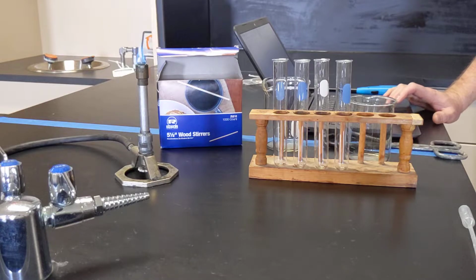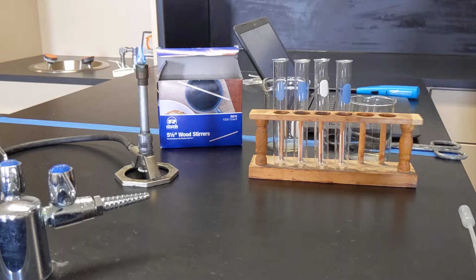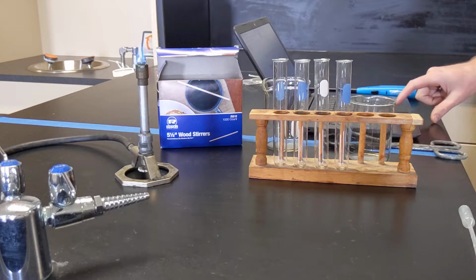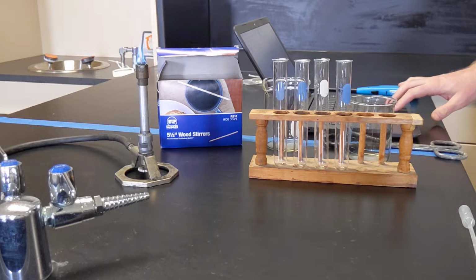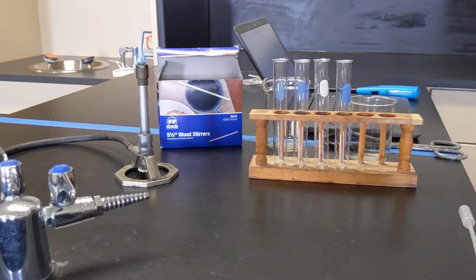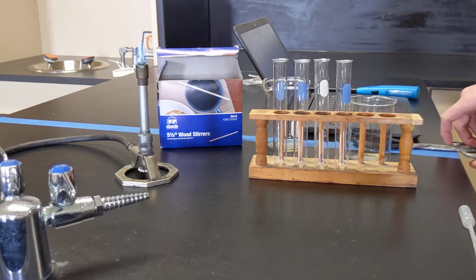The observations are to be taken at the top of the second page. There's a data table there where you can just write the observations in. So as you're doing this lab, the video, the only thing you really need to be paying attention to are your observations. The other parts of the table can be filled in by reading the document carefully to figure out what all of the chemicals are. But as far as this video is concerned, really the only thing you need to be doing is writing down observations for each reaction.